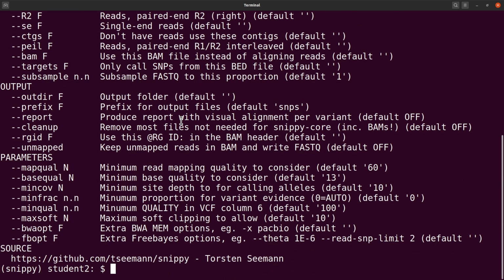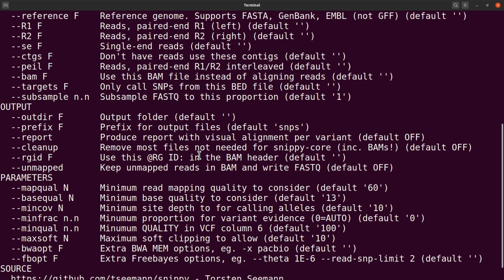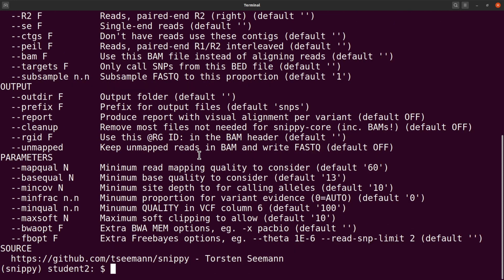So that's it. Now we have everything we need, and I'm assuming that you've also followed and gotten your environment activated. So we know that everything is in place. It's now time to start the practicals itself. Let's clear the screen and then continue.